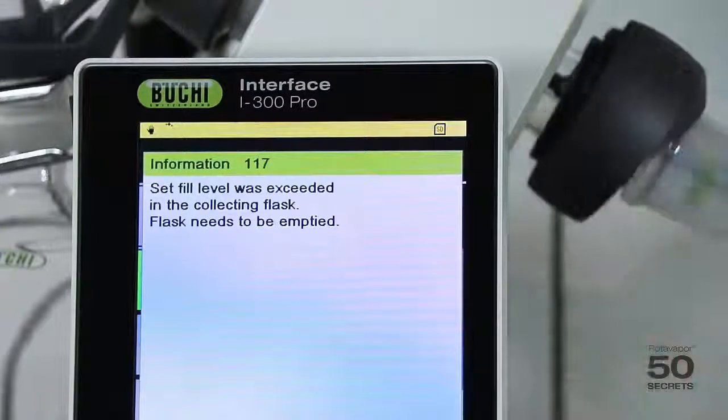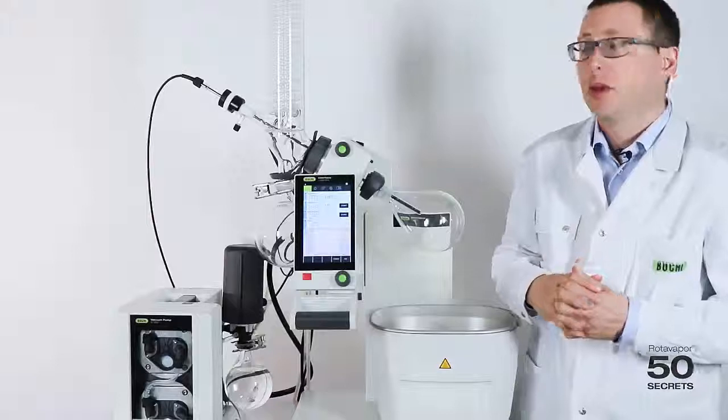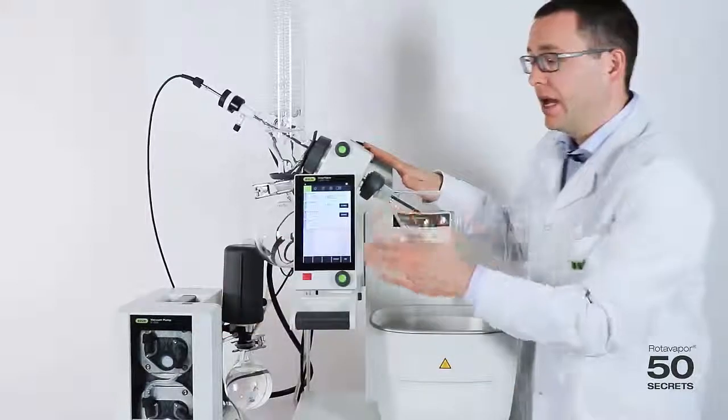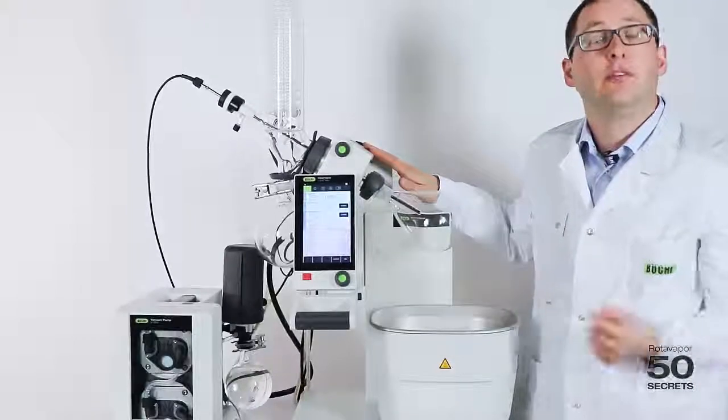As mentioned, the distillation continues. So that's how the level sensor works. It's a perfect combination with the R300, and it's only compatible with the vacuum pump and one of our interfaces. It is not working with house vacuum.